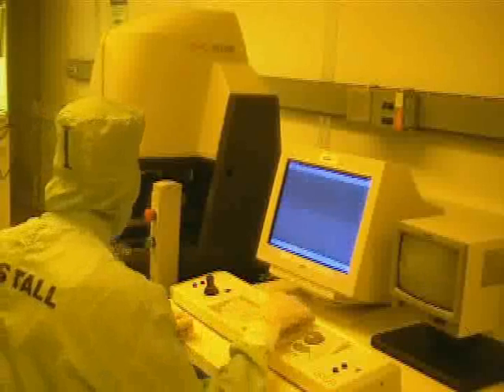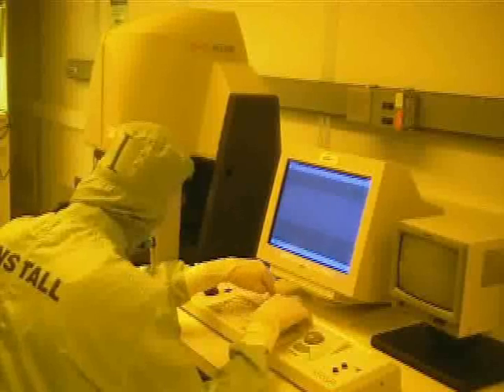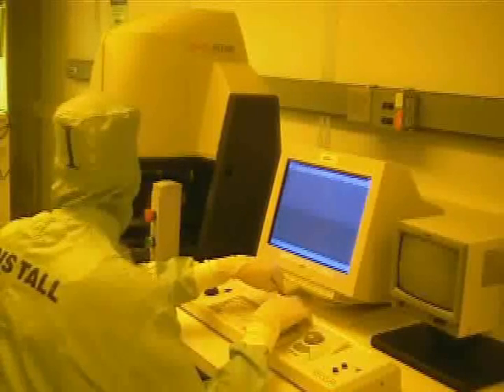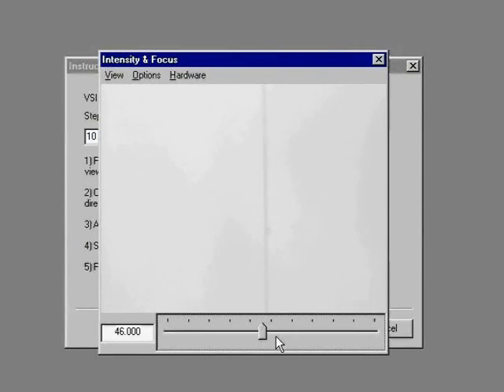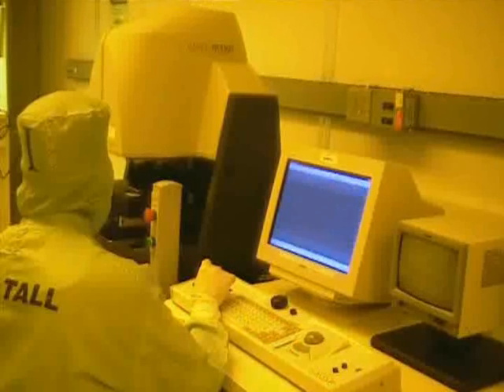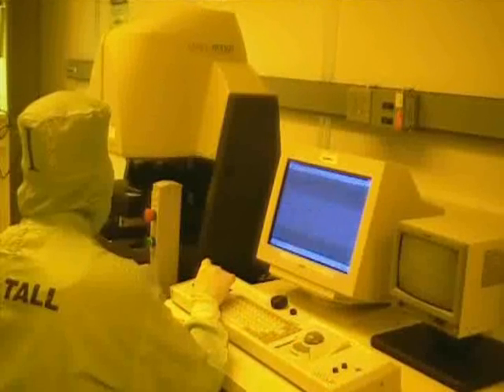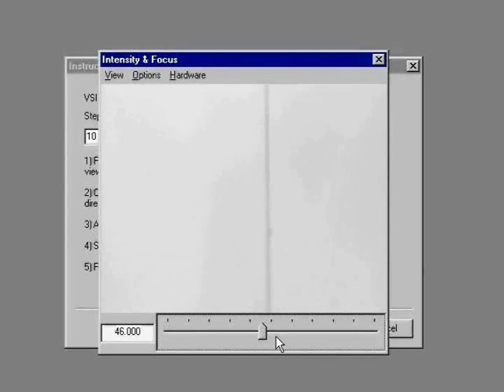Now focus on the calibration sample by pressing the fast button and rotating the focus knob to the right slowly. The first image you will see will probably be a false image from the bottom of the calibration sample. Continue raising the objective until you see the true surface. Now you can use the joystick to scan across the sample to find the step. This is the step — it is a rectangle that is etched into the calibration sample and it is 10 microns deep.